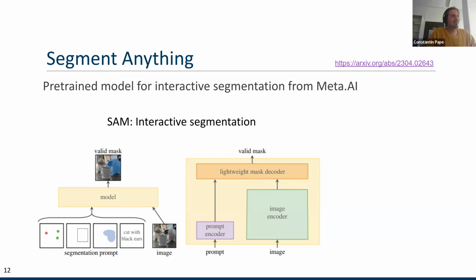So right now, this is a strong statement, but most of the time you can improve it through fine-tuning; it will just take its time, especially if you don't have a powerful GPU. That's the idea behind the parameter-efficient fine-tuning techniques that I mentioned at the end. Instead of fine-tuning the full image encoder, you only fine-tune small parts or extra parameters. That's how we hope to make this more efficient, but it's still ongoing research. Thanks.